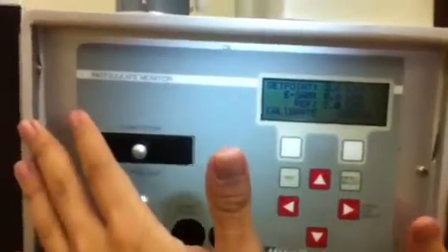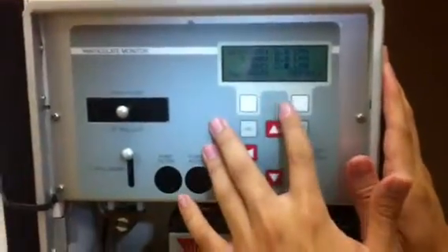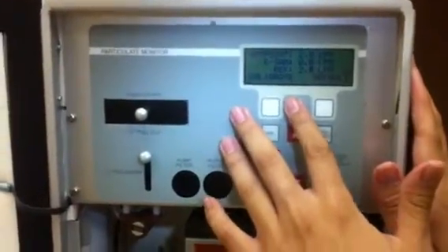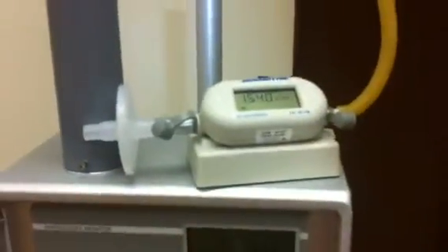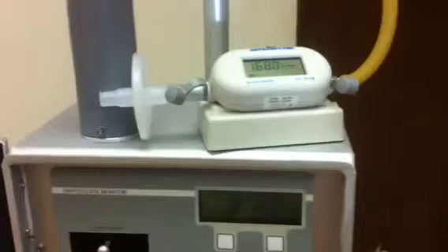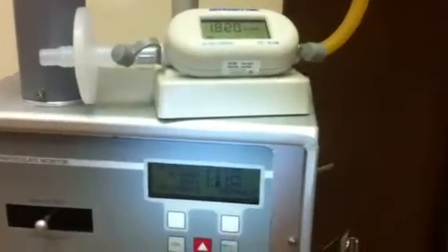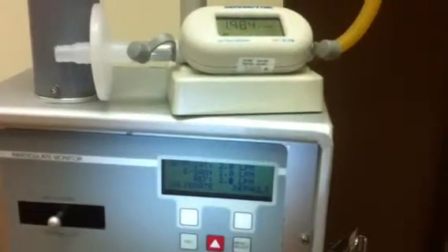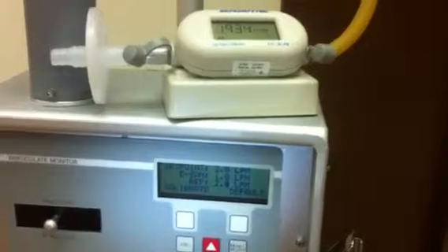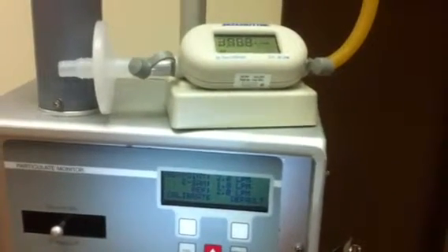Now the e-sample is starting to do the calibration. You can see the flow here. The tolerance is plus minus 0.1 liter per minute.